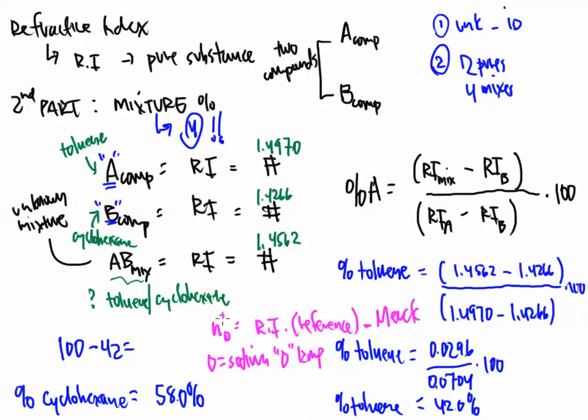Sometimes you'll also see a number up here at the very top, and that number, if it's listed, is the temperature. So 20 degrees or 25 degrees or 30 degrees, what is the temperature of the sample that you ran? There's a proper temperature correction that we should do with the refractive index reads, but we won't go through that now. We'll wait until later on to look at that temperature correction because that's just too much. So what we'll do is we'll learn how to use the instrument, learn how to read samples with refractive index, and then we'll take this data and look at some charts and some calculations with it. But there is a proper way to correct for the temperature if it's not at 20 or 25 degrees.